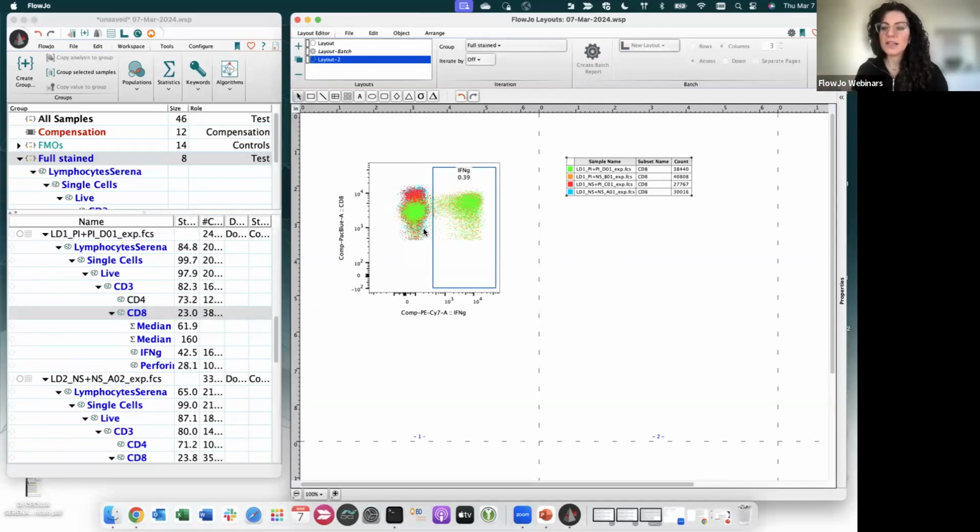I'm Italian, so I like to make these similarities. You can change the order of your overlay. Whatever we brought first is all the way to the back, and whatever we added last is all the way in the front. So you can change the order by changing the order in your legend. So I can just move whatever I want in front of my overlay all the way up, okay?